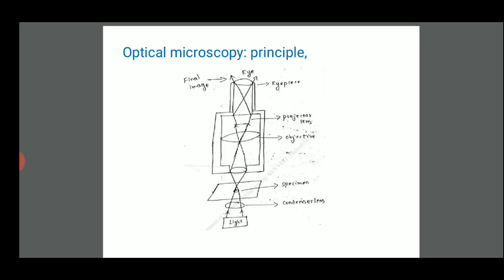The image from an optical microscope can be captured by normal light sensitive cameras to generate a micrograph, and the function is to create a magnified image of a specimen. It consists of three basic functions: obtaining a clear sharp image, changing the magnification, and bringing into focus.